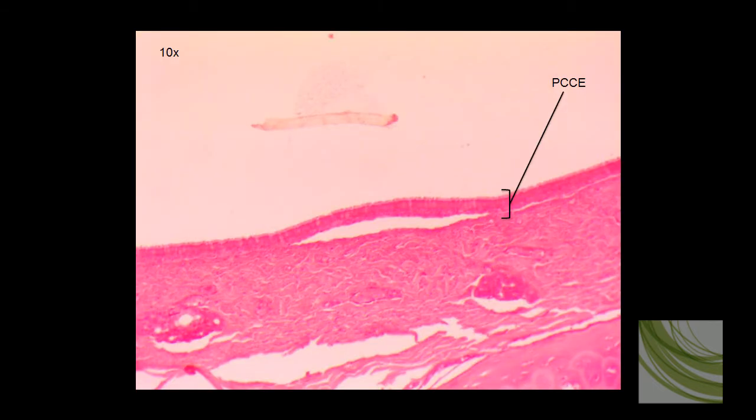Here we have increased magnification. We're now using the 10X objective, and we can actually see some of the cilia along this ciliated columnar epithelium. Again, here is the layer of pseudostratified ciliated columnar epithelium, and the tissue underneath becomes a little clearer. This is clearly dense, irregular connective tissue underneath.